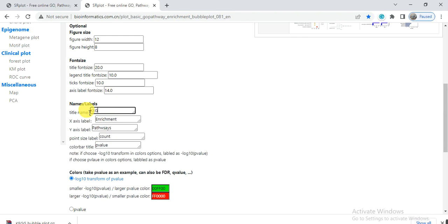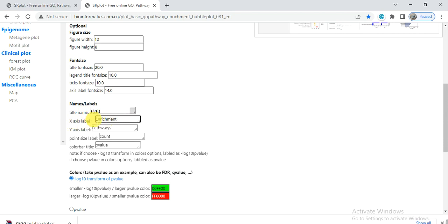Here in the title name, give the title of your analysis, such as 'KEGG Pathway Enrichment Analysis.' The x-axis level is enrichment, and the y-axis level is pathway.